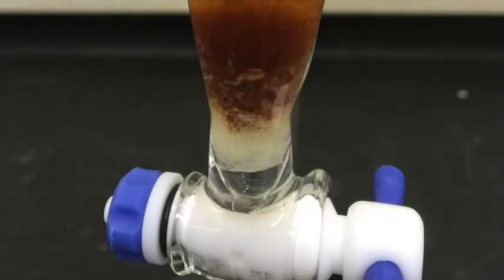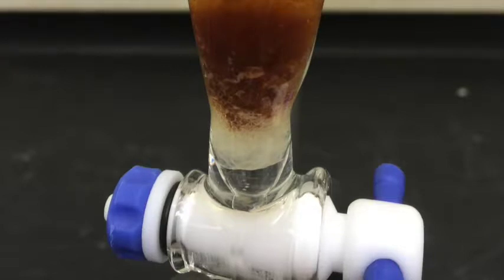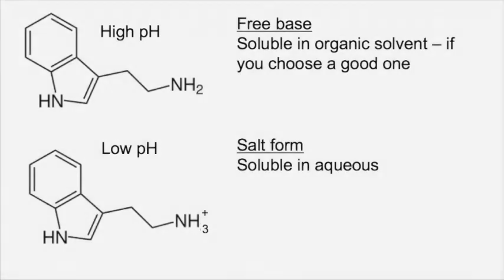Also, be really conservative when you're draining a sep funnel. Here you can see that we've made sure to stop the sep funnel before any of this garbage gets into your sample. If you lose a little bit of the solvent, you see there's a little bit of solvent sitting there, we can try and get that little bit more, but don't. Just leave it. It's okay to lose a little bit of that nice transparent solvent, but you don't want any garbage in your sample. It's very important not to pull any garbage into your sample, or you'll have to keep going with the extraction to make it pure.